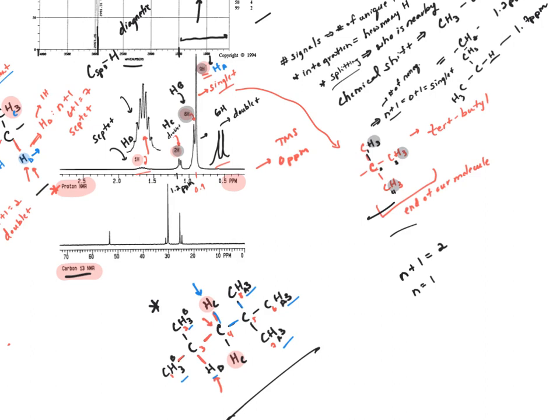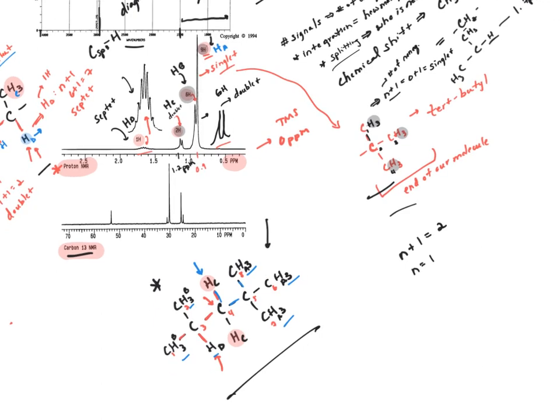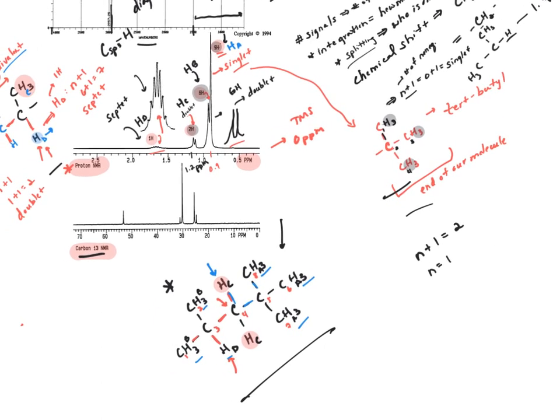Okay, so that's it. I would prefer these to be in Lewis structure or drawn like this, as opposed to a bond line structure. You could also, to make it nice and easy, draw the bond line structure. So for this guy, it would be something like this. But I again need to see the protons, right? So that's why this is going to end up being better overall. Okay, so that's one, right?